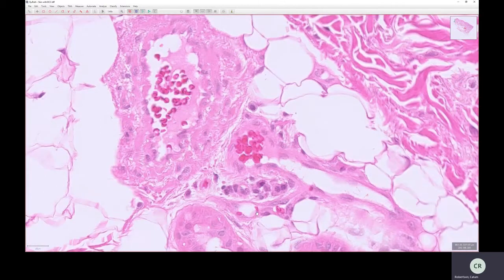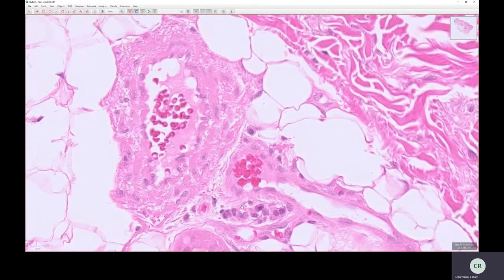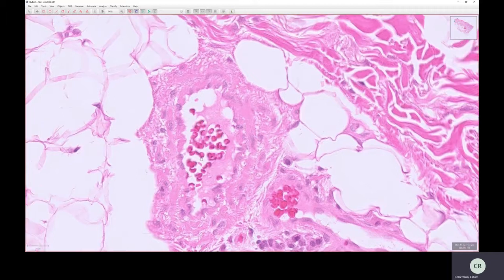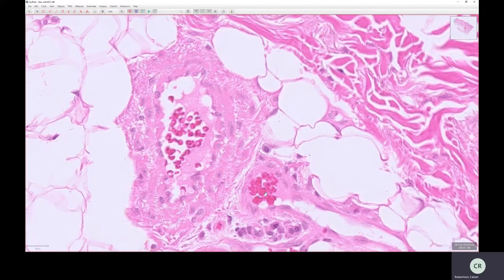This is quite good. You can see the side on. You can see the concave appearance of it. This almost looks 3D. This one you can see the concave appearance of this. That's a little hollow in the middle of that cell. So we see them in all sorts of different orientations, but these are all erythrocytes. And I know that because they're just taking up eosin, they have that concave appearance, and they're not taking up hematoxylin. There's no nuclei. Also, it's helpful, you can see them inside a blood vessel, and they're abundant.